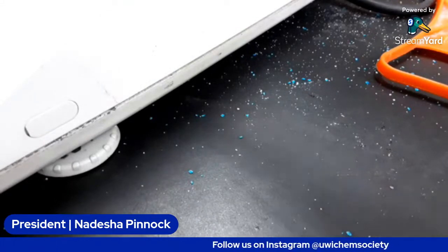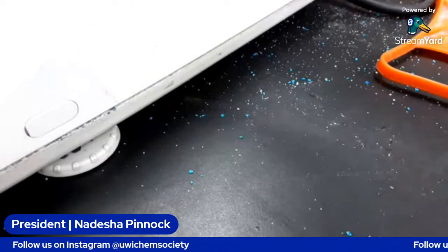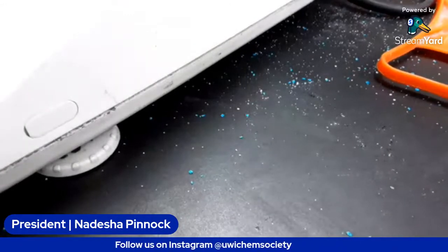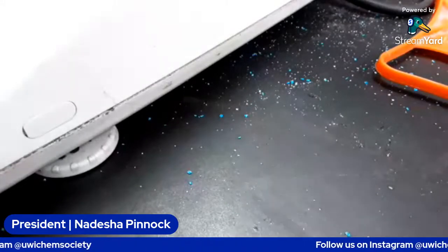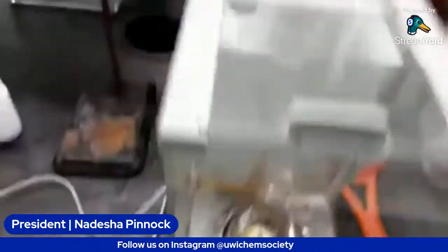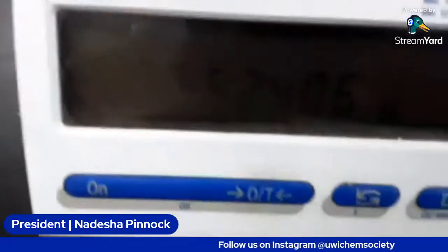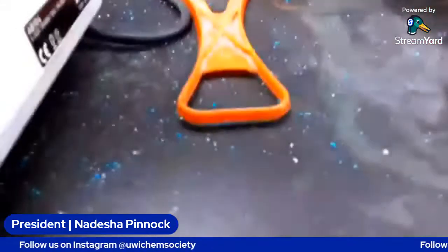I'm just going to add it until you see 5 grams on the analytical balance, which is a lot more accurate than what you call a top pan balance. Top pan balance usually has two or three decimal places, so it's not as accurate and it has a lower precision. And also analytical balances are covered or surrounded. So when you close this, it actually reduces the air resistance. So we have 5.247 grams, which is good enough.